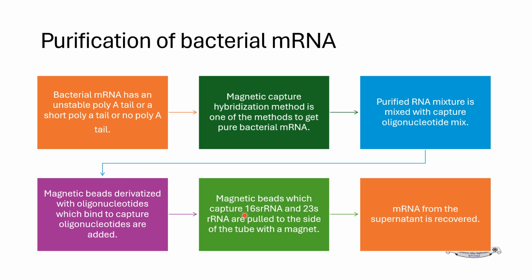So what happens? mRNA cannot bind to these magnetic beads, so mRNA remains in the supernatant and it can be eluted from the supernatant.